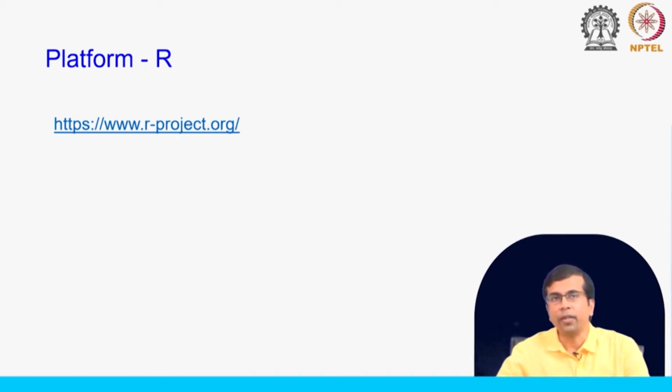So, from that point we can now take this forward in the R platform. Okay. So, HISAT2 runs on the terminal of Linux, and HTSeq count we have also used in the terminal. From there on we can now use the R platform to do all the analysis that we would like to do. Okay.